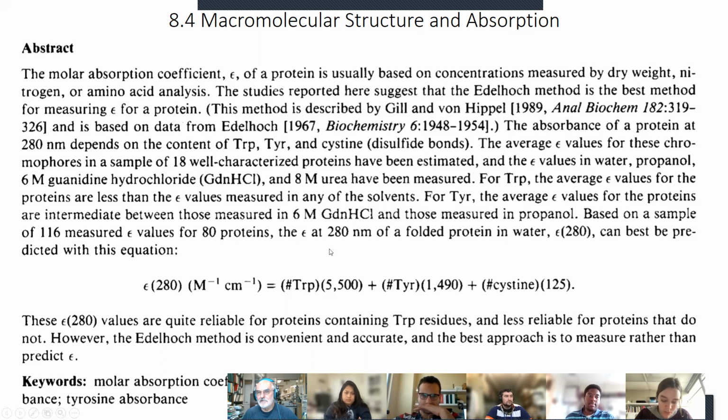You have to worry about how it's equilibrated in the buffer, so it's not just solid into a solution. And then you literally evaporate the sample and dry it down, and you measure the quantity left behind. So you have to measure the jar that you're going to make the measurement in without the solution, then fill it, and then dry it and measure the difference.